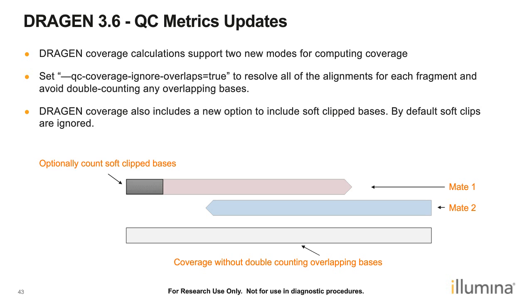And again, this is to align with some of the metrics that some of our GATK customers have been using in the past, and they have been transitioning to DRAGEN, and they fed that back to us.